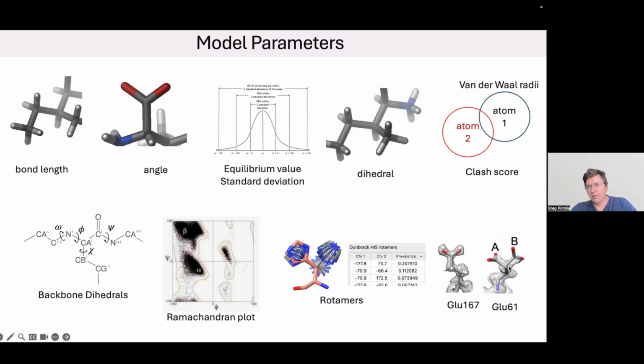And finally, one thing that we're starting to see more recently with higher resolution structures is that oftentimes you can have just one single conformation for a side chain, and here we can see it's well resolved in the density. But there are also cases when it's less resolved, where you see evidence that there's actually more than one possible rotamer, or alternate conformation, for a side chain.